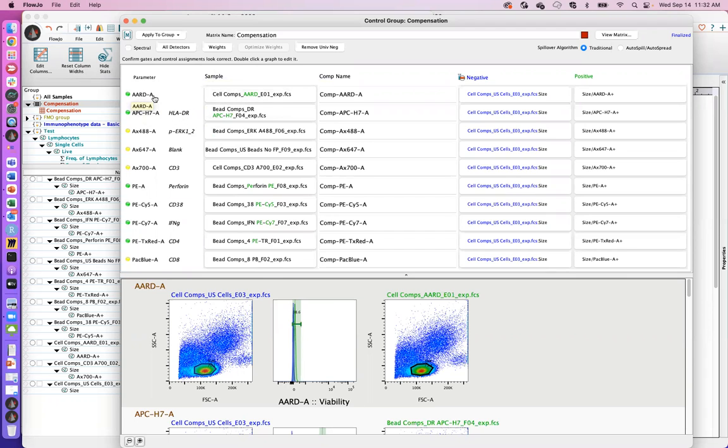So the fluorochrome should be matched up with the single stain control for that fluorochrome, and it happens to be, so this is good. You get a nice little green dot. If there's a mismatch in the name, you get a yellow dot, and sometimes if FlowJo cannot find the correct file, you'll get a red dot. Maybe sometimes if FlowJo can't create the proper gates on the file, you'll get a red dot. I normally tell people don't pay too much attention to the color here.